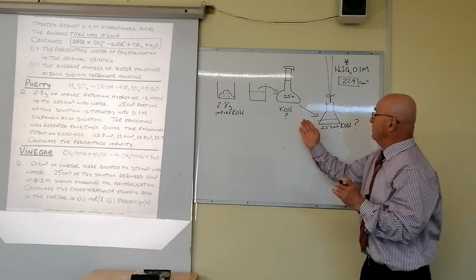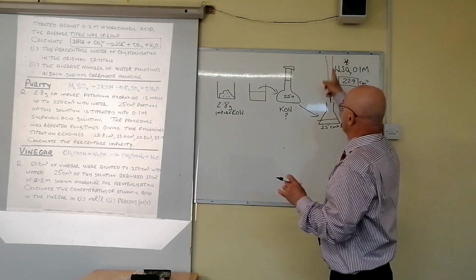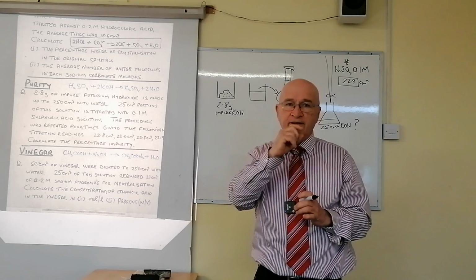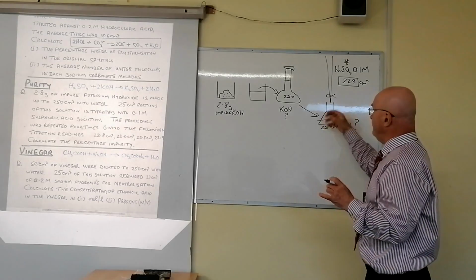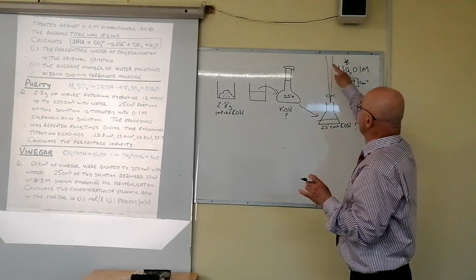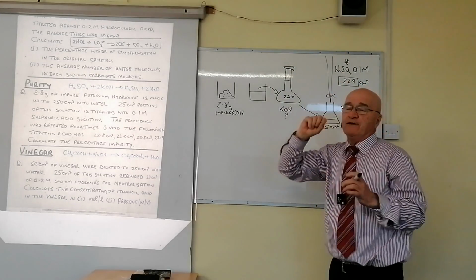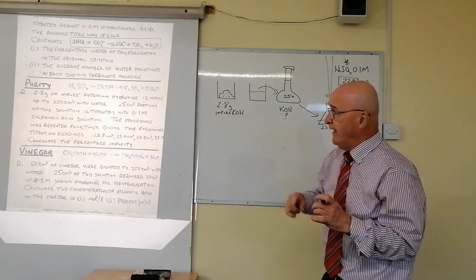Either that or that. Prepare a burette. You wash the burette twice with deionized water, and then the solution you're going to put into it, which happens to be sulfuric acid. You open the tap and you discharge some liquid into a beaker until you have the solution at the 0 mark. And then, sorry, you should have mentioned you fill the burette using a funnel, okay, a funnel again, and remove the funnel before you start, and you're ready to go.